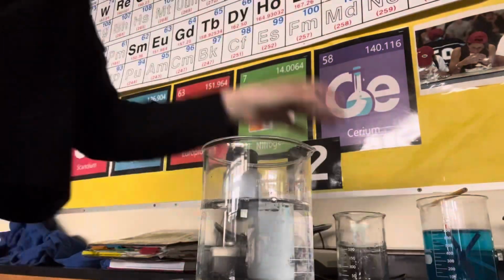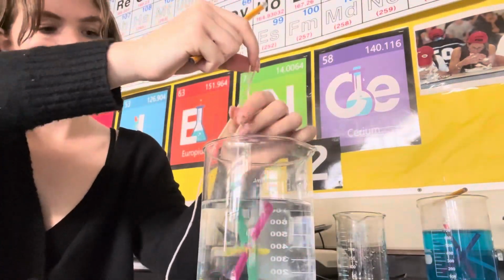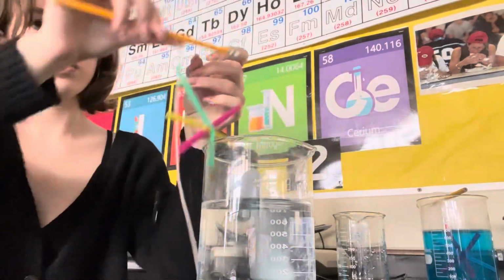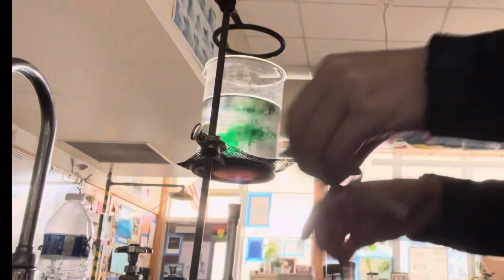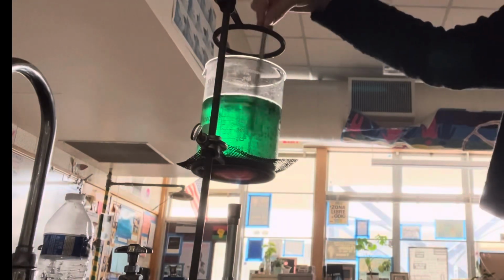Then I decided to repeat the whole process again, but using a 4-to-1 ratio of the borax to water. So I did 4 spoonfuls per 1 cup of water. And again, it was the same 3 cups of water in the larger beaker. And this time I decided to use green food coloring so that I could tell the difference between the 2 solutions, but in the end it also didn't make much of a difference in the color of the snowflakes.